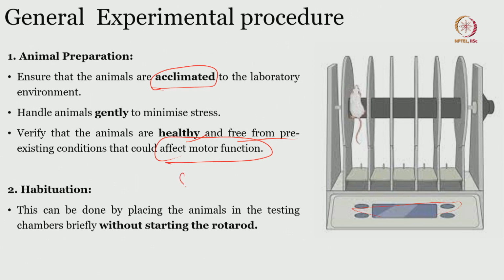For example, if you have used sedation, you need to make sure the sedative has come off, or if a drug is being used for any reason, you need to make sure that it does not affect the motor function. Those become confounding factors for this particular experiment.